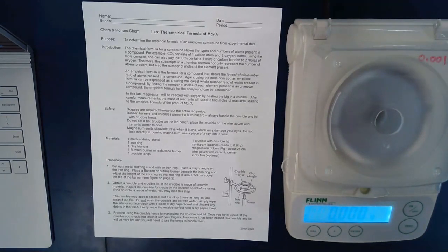We learned in class that you can find the empirical formula of an unknown compound from mass data, and so today we are going to collect some mass measurements on the magnesium, and then the magnesium after it reacts with oxygen, and then we'll be able to calculate the number of grams of magnesium, number of grams of oxygen, and then once we do that, we can convert that to moles. Those moles will become the subscripts, and then we would find the lowest whole number ratio of those subscripts to get the empirical formula for the product between magnesium and oxygen, what we're going to call MgxOy, because the X and Y are the unknown moles.